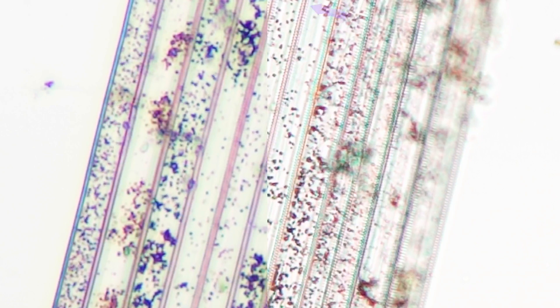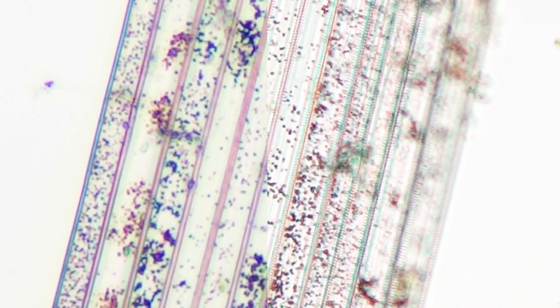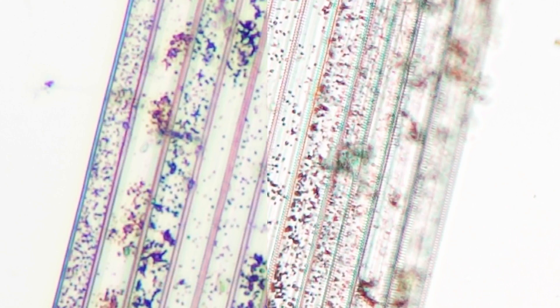See how those little ridges on the cells don't even show up under the low numerical aperture lens. And those jiggly bits are blurrier too.